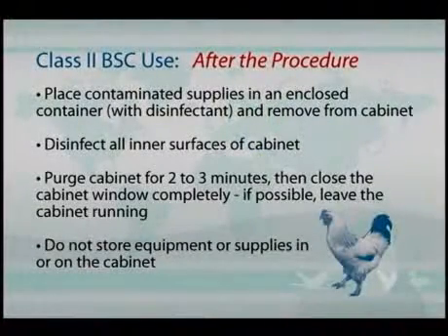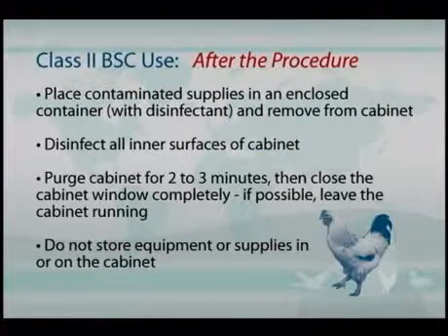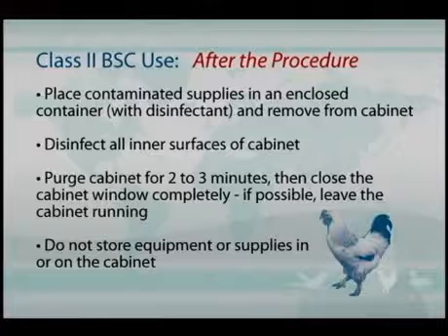These high-efficiency HEPA filters, unless you're working with a lot of dusty or dirty material in these cabinets, will last for several years. So it's not a matter of plugging these up. And actually, the efficiency of the filters does improve a little bit with some accumulation of material on the HEPA filters themselves. And of course, they should be kept free of extraneous materials and should not be used as a storage cabinet or piece of equipment.